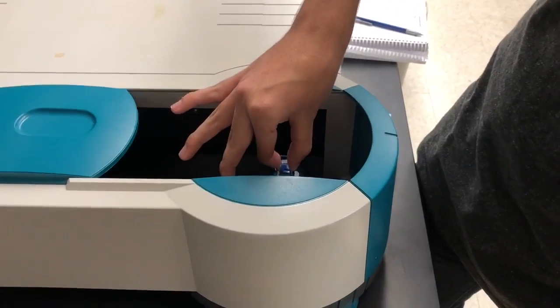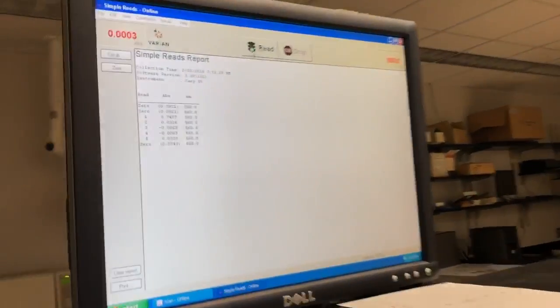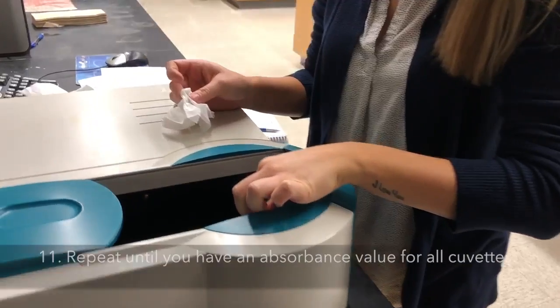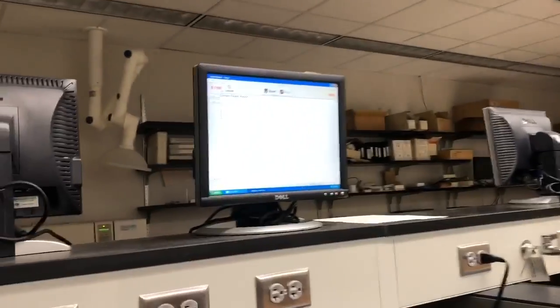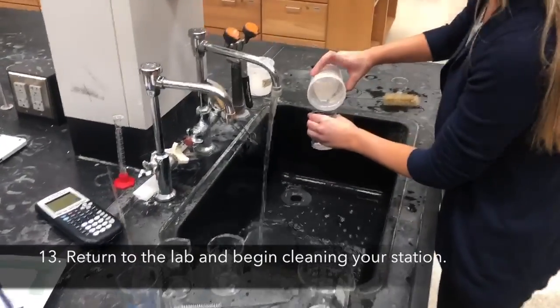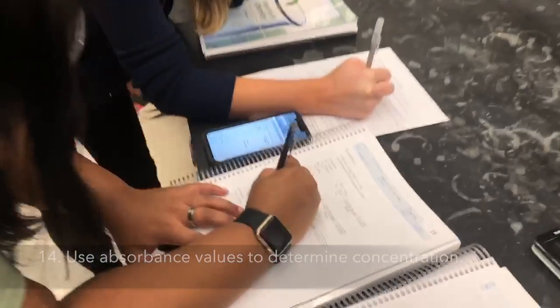Repeat the steps as before. Wipe the sides, place the cuvette in the scanner, close the lid, except this time click read. This will give you your absorbance value for that dilution. Remove the cuvette and repeat until you have all of your absorbance values. Now, transfer your absorbance values into your notebook and return to lab. Clean up your station and then begin calculations in order to determine the concentration of the unknown.